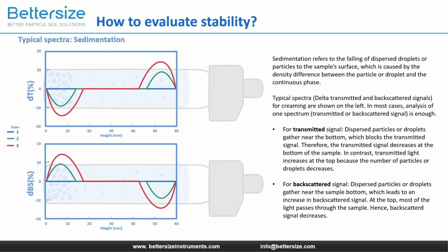The first one is sedimentation. Sedimentation refers to the falling of suspended particles. Here I present delta transmission and delta backscattering spectra of sedimentation. As time goes on, more and more particles scatter at the bottom, resulting in an increase in backscattering and a decrease in transmission at the bottom.